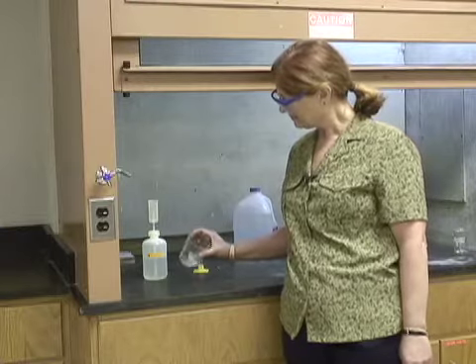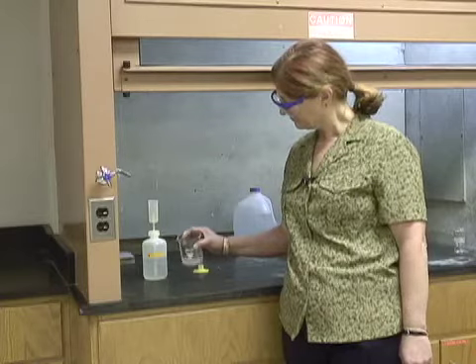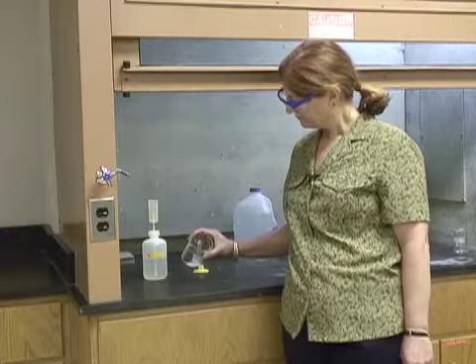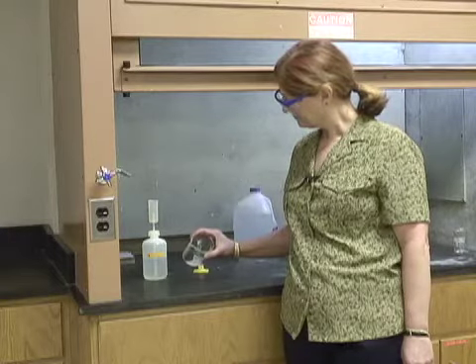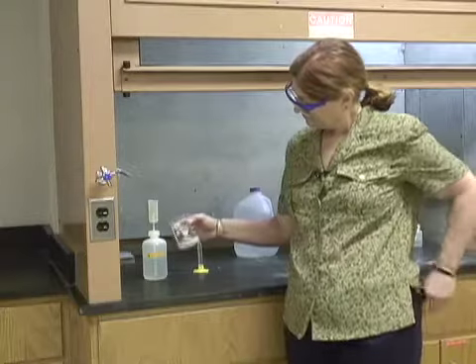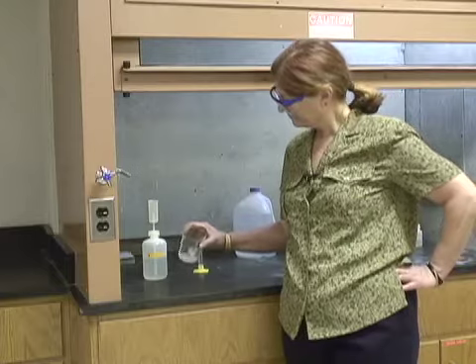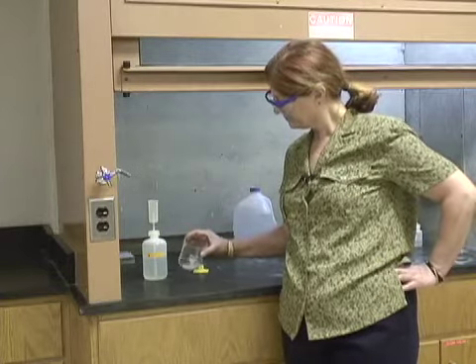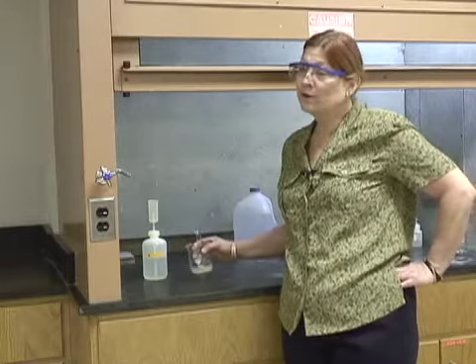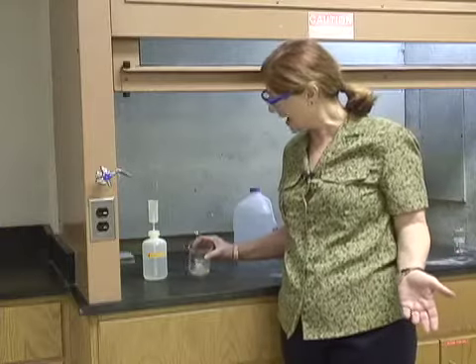That magnesium. Interesting. Now, if I were to set this down and walk away, it wouldn't happen any faster, because then the particles would not be exposed to the acid.